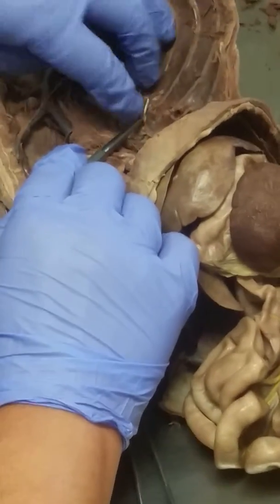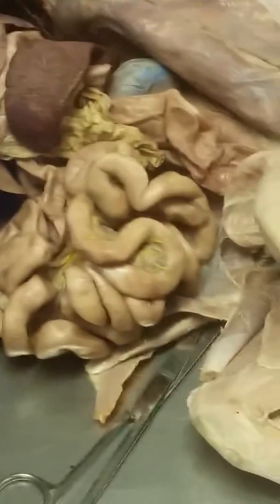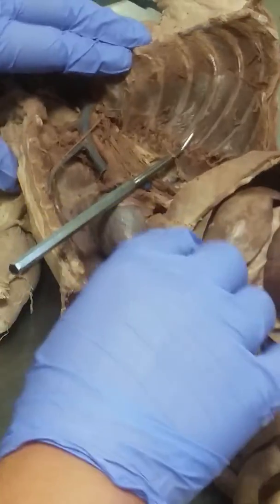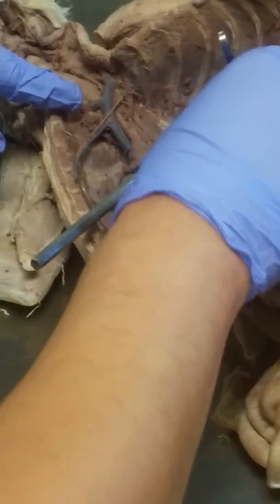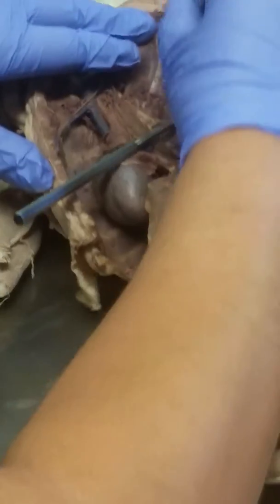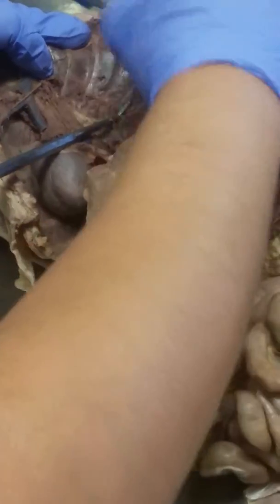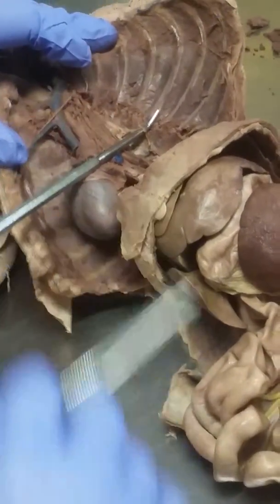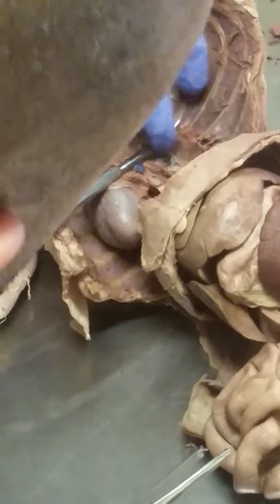If you clean it up nicely, it looks like dental floss. And this is the sympathetic trunk, right? And it's going to run along both sides of the vertebral column, or along here, right? And coming off of it, you have little communicating rami that go through to each of the vertebrae, to each of the ribs here, right? So this little dental floss looking thing is the sympathetic trunk.